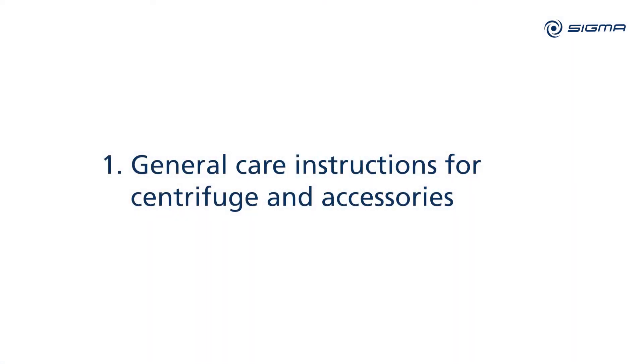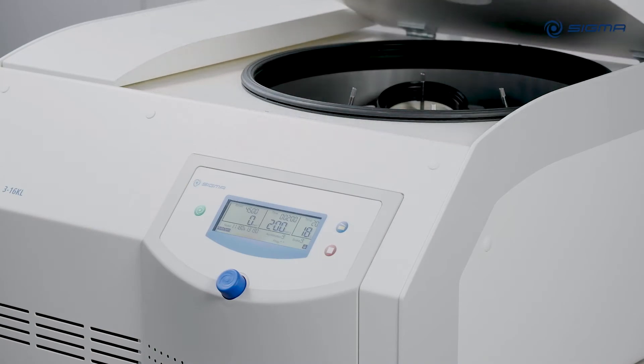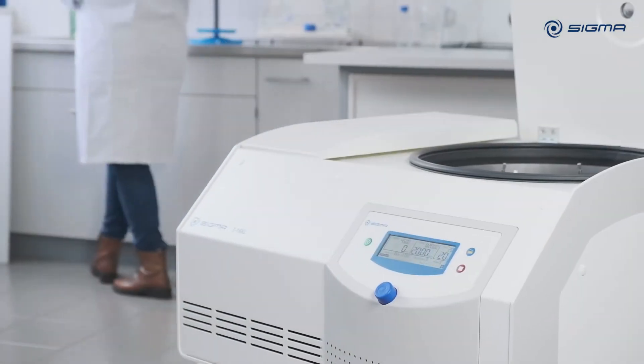Check the condition of your centrifuge each day before use. Only a few small actions are necessary to keep your centrifuge operating safely and reliably for a long time.